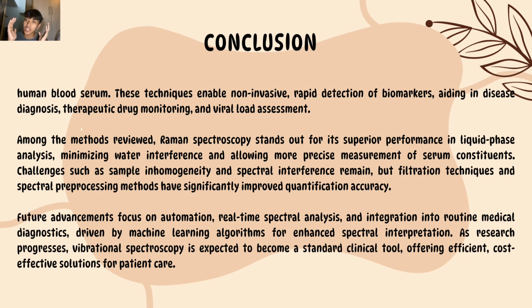Alright, to summarize, vibrational spectroscopy, especially Raman, offers a fast and non-invasive way to detect and quantify blood serum components, while challenges remain like sample variability and data complexity. Solutions like filtration, spectral processing, and machine learning are making the process more accurate and scalable. As automation and clinical adoption progress, we believe vibrational spectroscopy will become a standard tool in diagnostics and also personalized medicine.